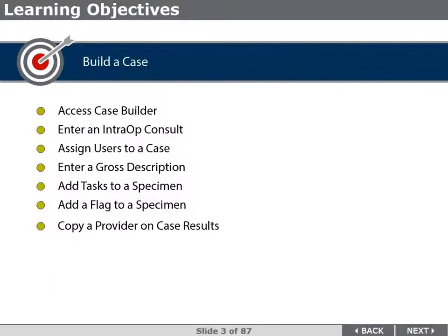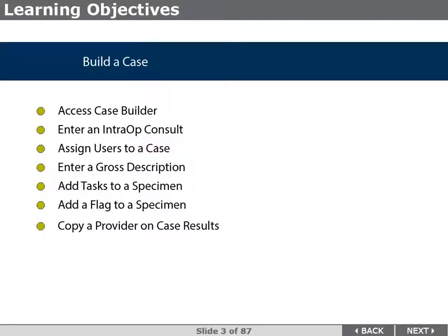By the end of this lesson, you will be able to access Case Builder, enter an intra-op consult, assign users to a case, enter a gross description, add tasks to a specimen, add a flag to a specimen, and copy a provider on case results.